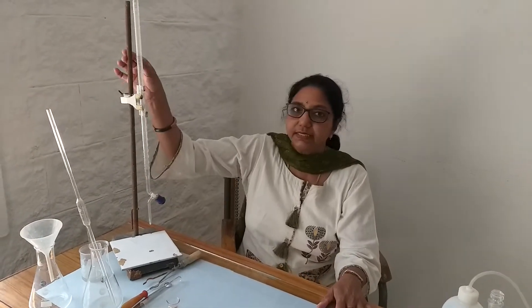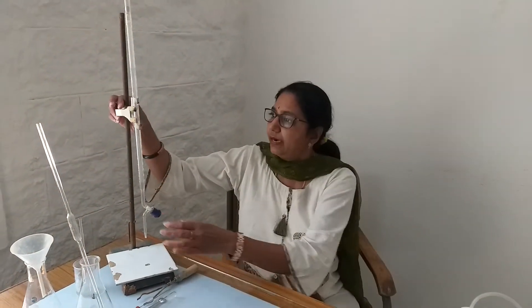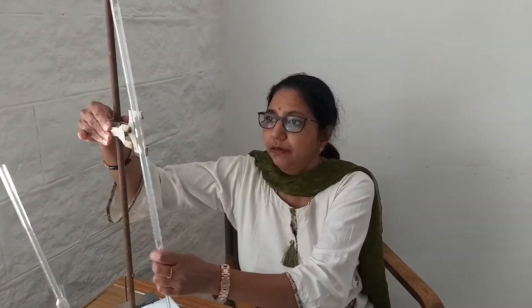We will start with this stand and the clamp on which you can see the buret is kept. This iron stand has a clamp, and this clamp is movable up or down to adjust the position of the buret. We can open the clamp and put the buret in position. A white tile is always required because whenever we go for the titration, the change in colour is noticed easily if the tile below is white.